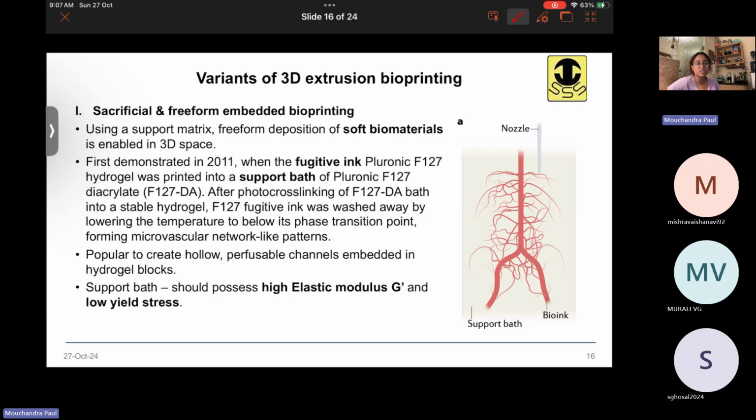You have to check the literature, the compatibility of the cell and the hydrogel material that you're thinking. And then you will also see the method of bioprinting that you're using. So if it is extrusion based with air, then you can use relatively less viscous materials as well. But if the system that you have is a screw based system, then you will think, okay, fine, we can use higher viscous materials as well. Okay. And then you see what fits best.